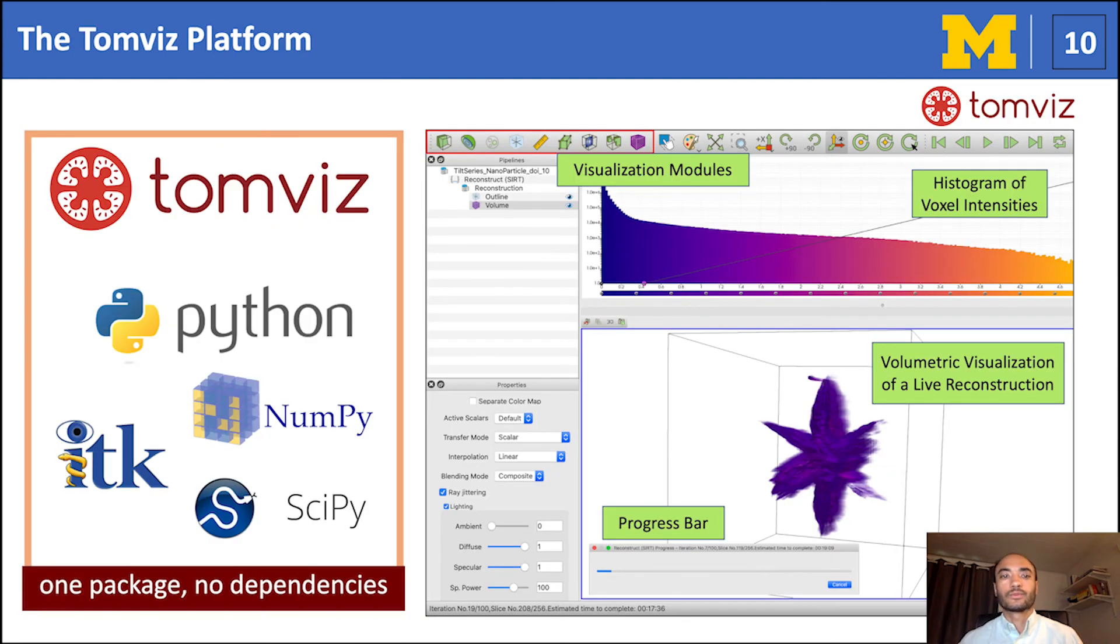TomViz is a cross-platform tool that runs across all operating systems and is entirely open-source. It is one package that can be easily implemented on rudimentary TMs available at most institutions. The software contains an easy-to-use graphical interface that allows users to select multiple visualization modules and track the progress of the computation. During the reconstruction, users can zoom, rotate, slice, and segment the object to highlight regions of interest as the algorithm runs independently. More importantly, TomViz consists of self-contained packaging, with a majority of algorithms written in Python, allowing researchers to share reproducible pipelines with collaborators.